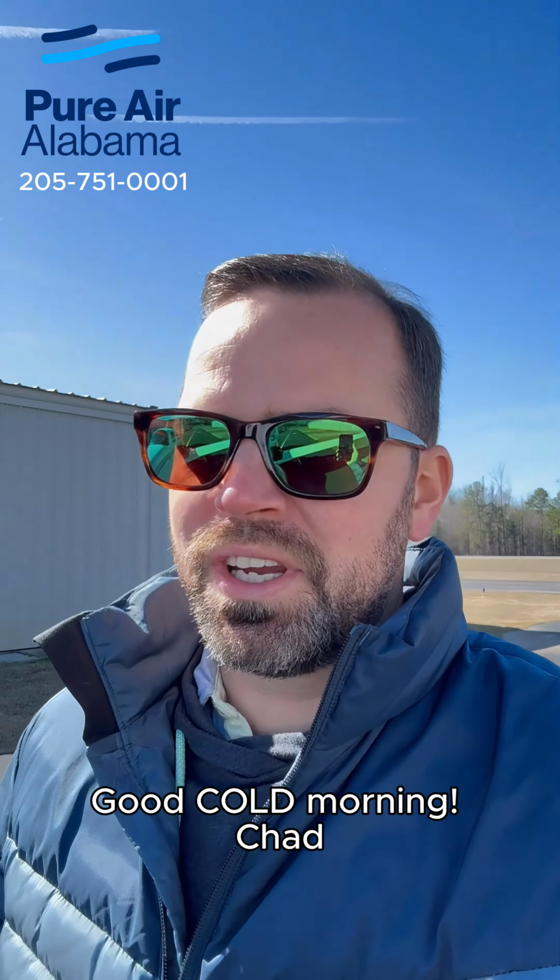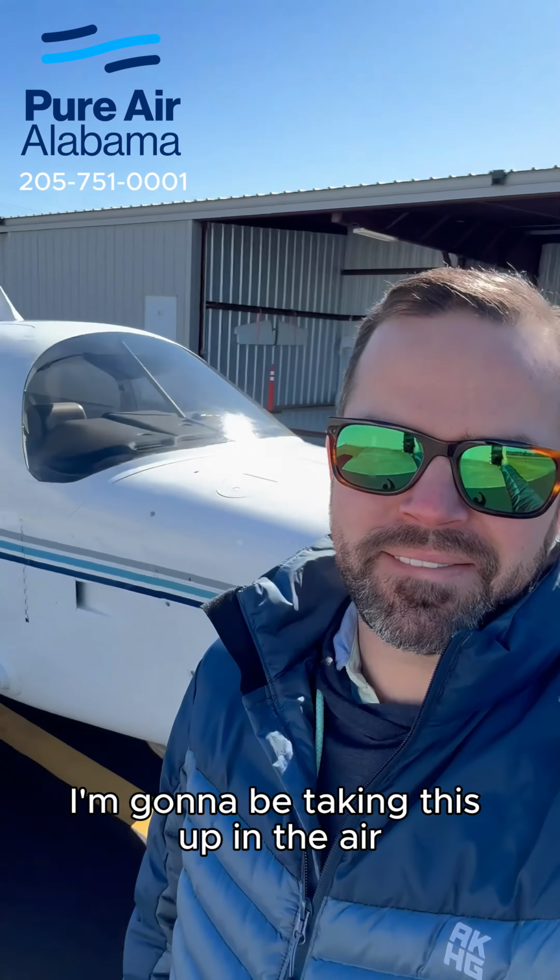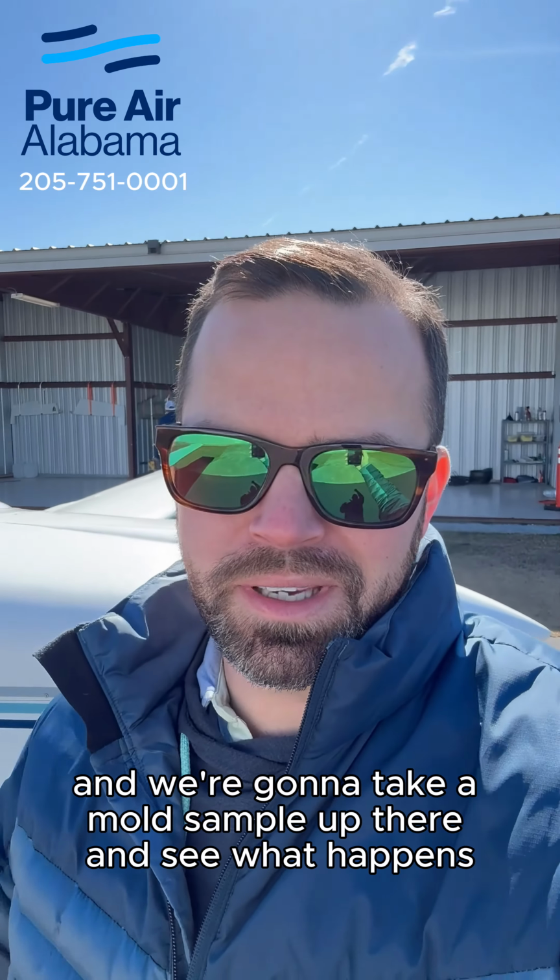All right, good cold morning, Chad with Pure Maintenance. Today I'm going to be taking this up in the air and we're going to take a mold sample up there and see what happens.